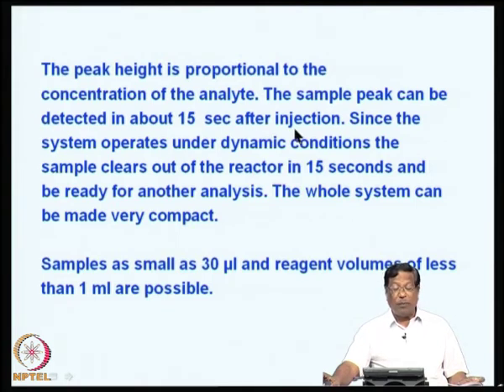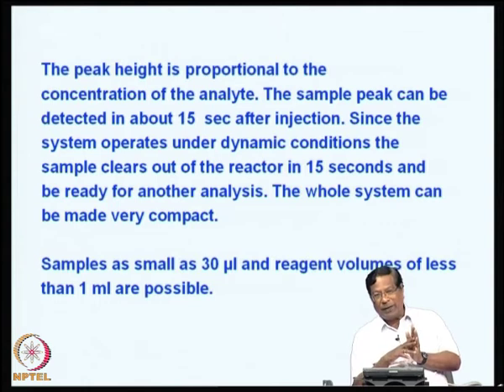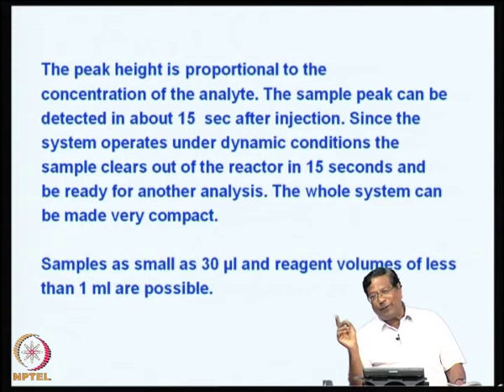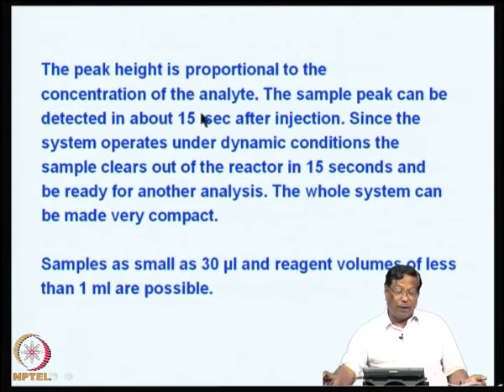Since the system operates under dynamic conditions, the sample clears out of the reactor in about 15 seconds, and then you can have a system where the reagents will be passing through without one of the important reactants. That means, again baseline conditions would be available for the system for you to inject the sample, and that sample will again form a colored complex.